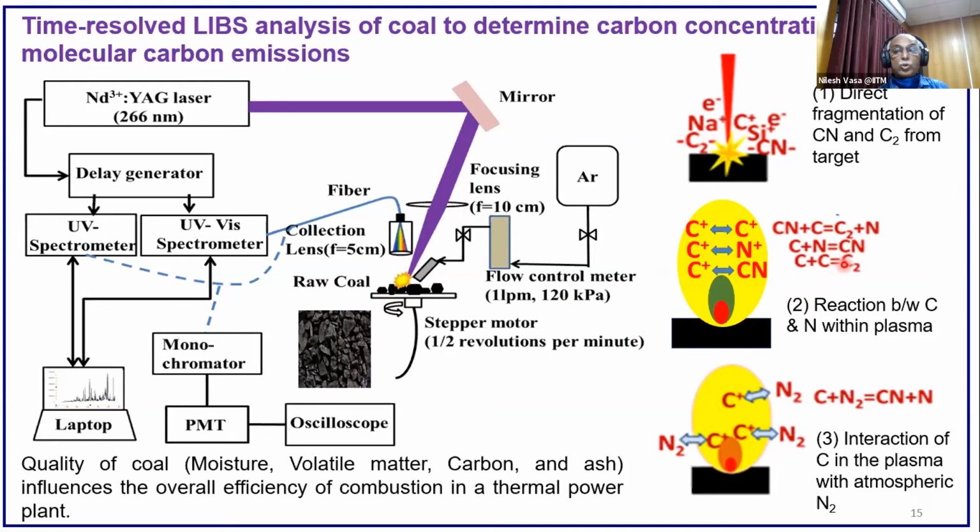So we will not be able to track the real carbon which is getting ablated from here.